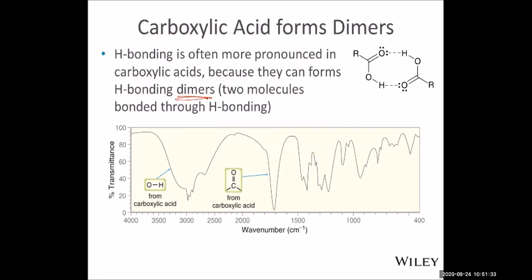And then the sp2 CH is also very small because the number of double bonds in the molecule is often limited. You have very small signals. And then below 3000, that's typical for sp3 hybridization, the carbon-hydrogen bond. That's where it shows up. And so that's, okay, let's see.